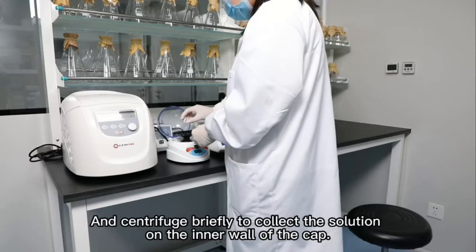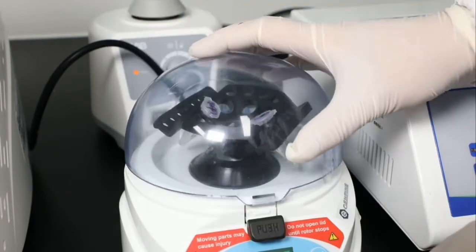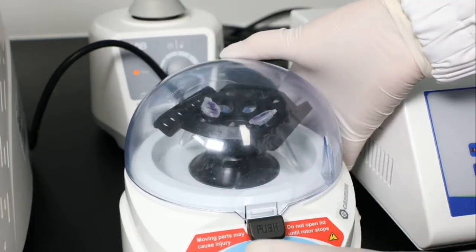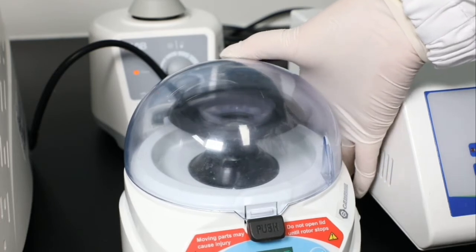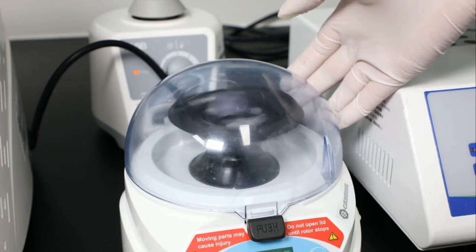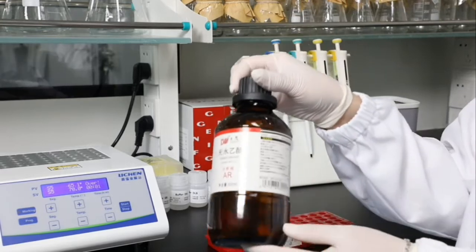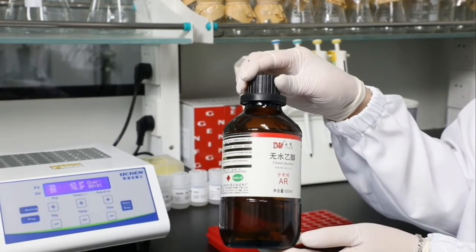Centrifuge briefly to collect the solution on the inner wall of the cap. Add 200 microliters of anhydrous ethanol.